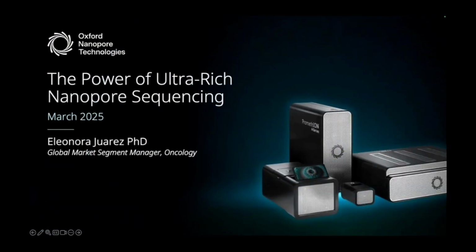I'm Ellie Juarez, and I just want to briefly tell you about the power of ultra-rich nanopore sequencing. And then I'll hand it off to really the star of the show here, Dr. Matt Luce, who will tell you about his tool, Robin, and how it brings a rich multi-omic view to CNS tumor profiling research studies.